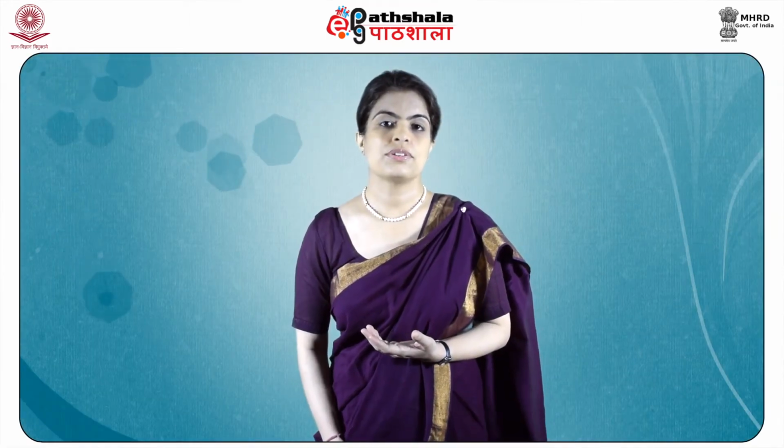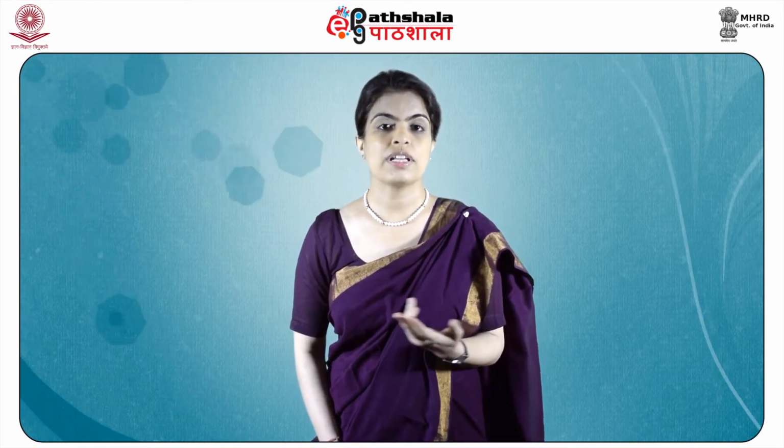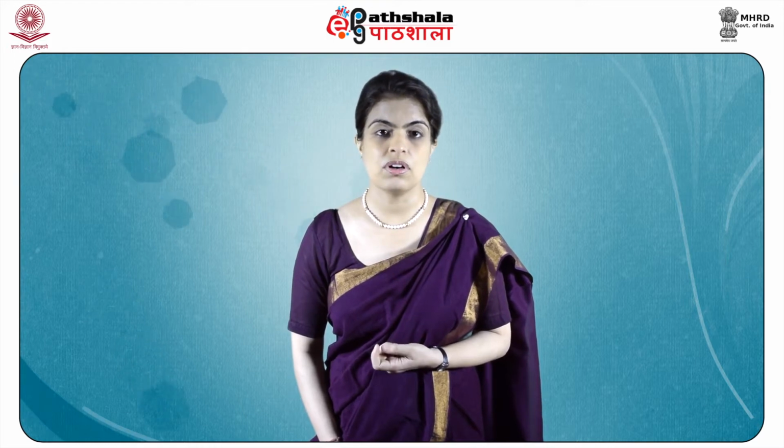Ion exchange chromatography works on the principle that charged molecules will adsorb reversibly onto the column and will be eluted by changing the ionic environment. The molecules in the sample mixture are first allowed to tightly bind to the column. Appropriately changing the buffer pH or altering the ionic strength of the buffer allows elution of the bound substances. The order of elution of substances from the column depends on their affinity for the charged groups on the column.